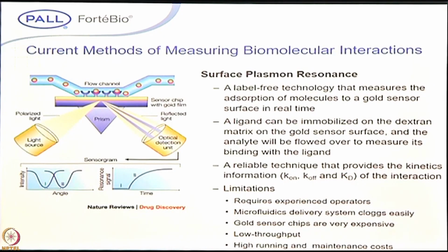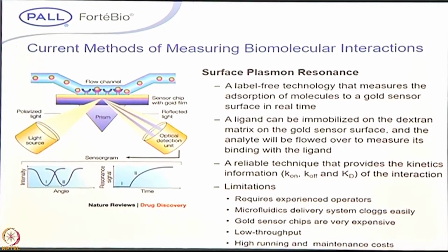The SPR technologies are real-time label-free interaction systems, where on the gold chip you have a matrix, to that you are coating one of the proteins of interest, and then you pass the analyte through the fluidic systems, and then you can see the interaction change with respect to the angle. When it comes to the limitations of SPR, you require a dedicated operator. Apart from that, the time required for the initialization and then getting to the data is tedious. It's almost a day it will take. So when you are doing such an interaction, you require more patience, and getting the data is more time consuming.